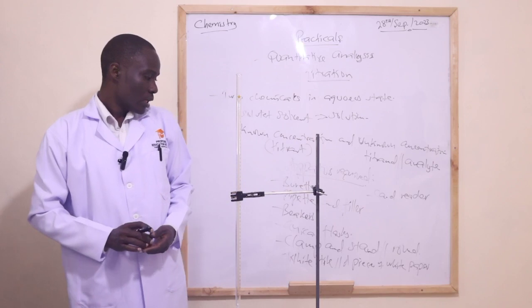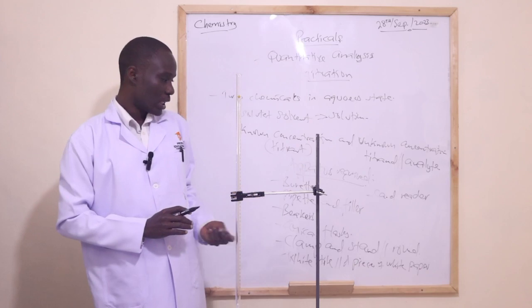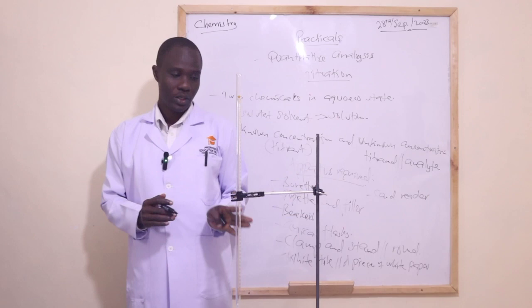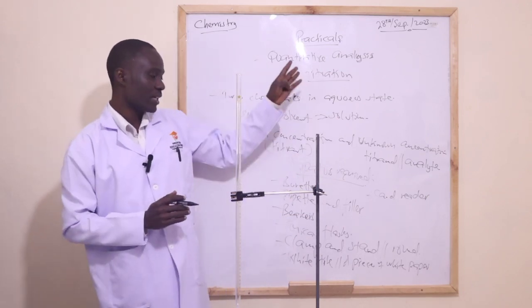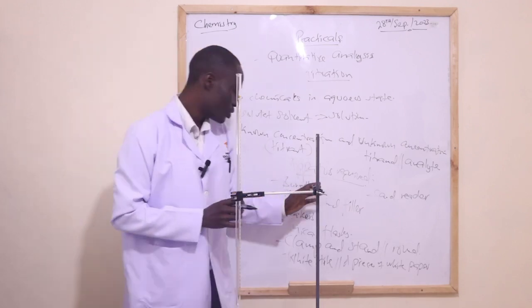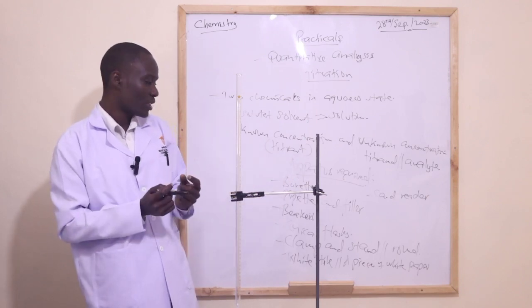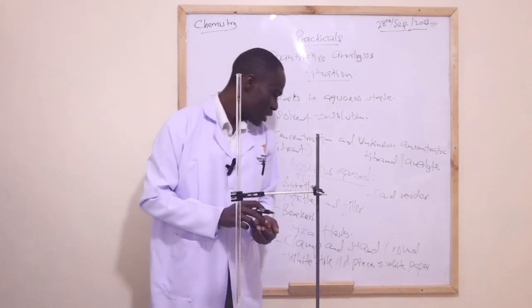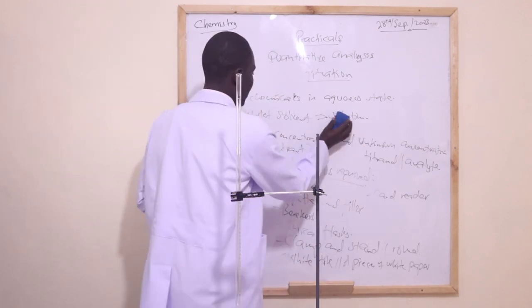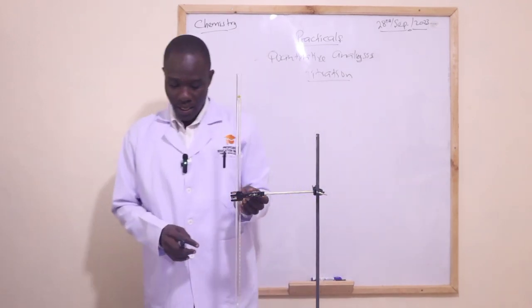So begin with the first one. In the procedure now, to demonstrate that which transpires during titration, I'll state how the burette is used, how it works. Allow me to rub off what I wrote. Okay. Now about the procedure.